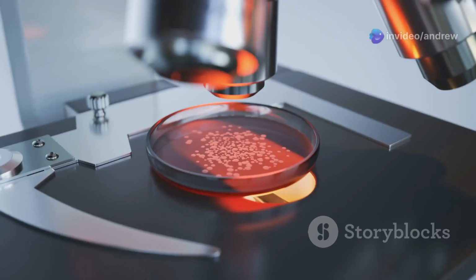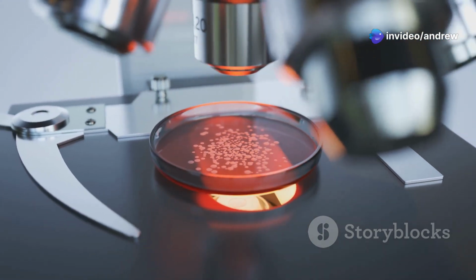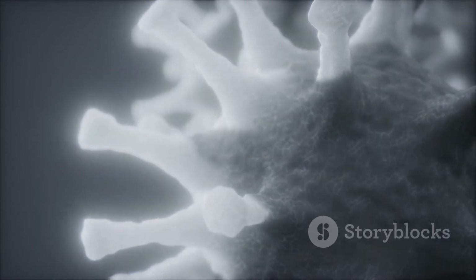Limitations: requires very thin samples. Complex sample preparation. Primarily provides two-dimensional images. SEM strengths: versatile, can image a wide range of sample sizes and types, provides detailed surface topography. Limitations: lower resolution compared to TEM, primarily for surface imaging.